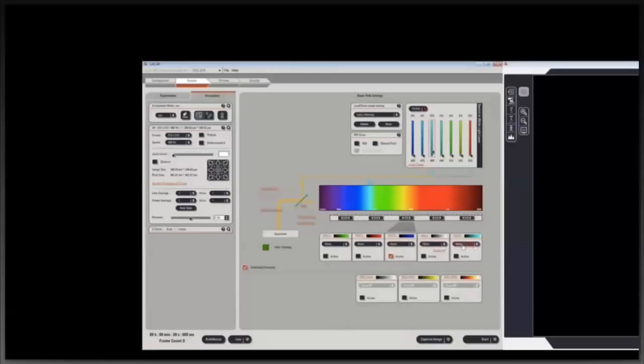We now have a number of different detectors that we can use. So as I've said before, the PMT, which is a photomultiplier tube, we have 5 different PMTs on our system. We have 1, 3, and 5, which all have the same specifications for normal confocal imaging. PMT2 we have for FLIM in particular, and we have a HyD detector in position 4, and this is specifically for STED. It's a highly sensitive detector, and it allows us to do gating.